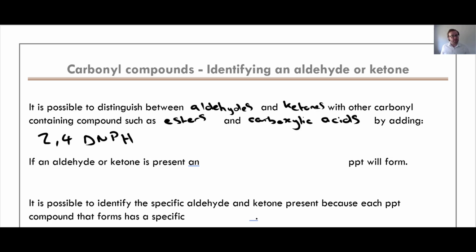You might see it as 2,4-DNP as well. If you did want the whole name, we would call this 2,4-dinitrophenylhydrazine. But 2,4-DNPH is fine. So this is the thing we add.